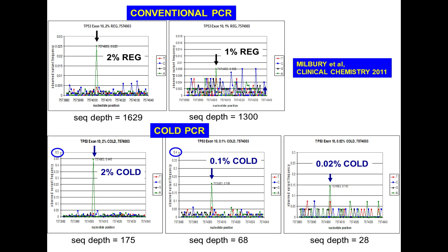Okay, so basically that's the limits of standard sequencing, unless one applies the newest development using molecular barcodes. But I'm talking now about the standard application that comes with the commonly used protocols.